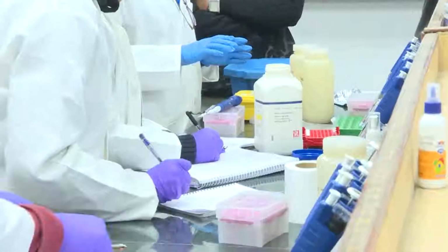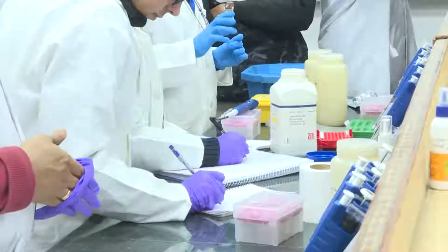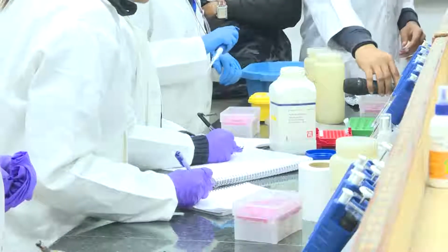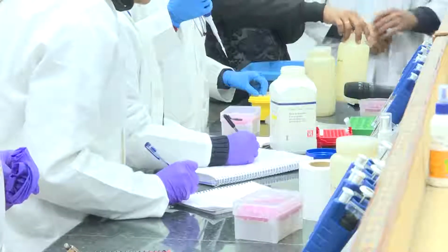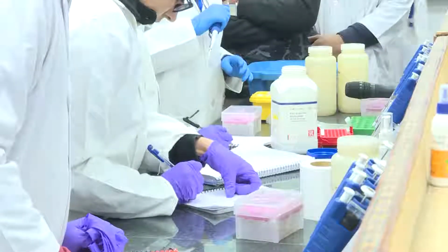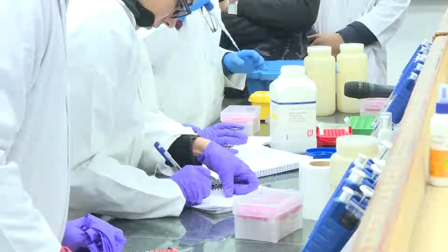So totally 6 reactions we will do. I'm preparing a 7th reaction for error correction. Now I'm preparing the master mix: nuclease-free water, forward primer, reverse primer, BSA, except DNA. The DNA will be added finally to the strips.